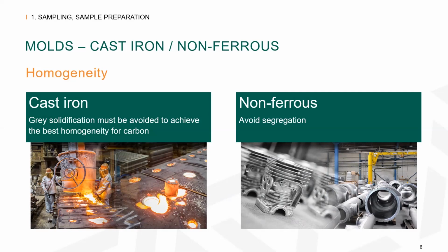To produce homogeneous samples requires a high cooling rate of up to 50 degrees Celsius per second, thermal conductive molds with appropriate material such as copper, clean molds, minimal sample size, ideally around 25 to 30 millimeters, and also an immersion probe used to eliminate faults that can impair traditional sampling, such as cold shuts due to interrupted sample casting, slag buildup, gray solidification, and complicated sample preparation.